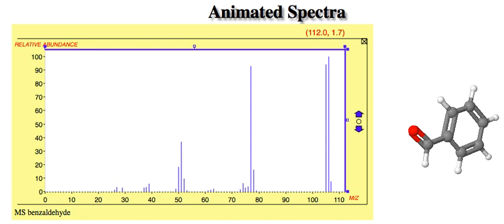And with the fragmentation patterns, sometimes you have patterns that help you to get the structure. Mass spec is not usually used alone. It's usually used in conjunction with some of the other tools we're working with: NMR, which we've been working with, and infrared spectroscopy, which will be my next series of videos.